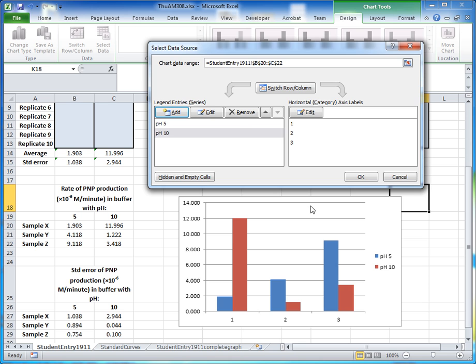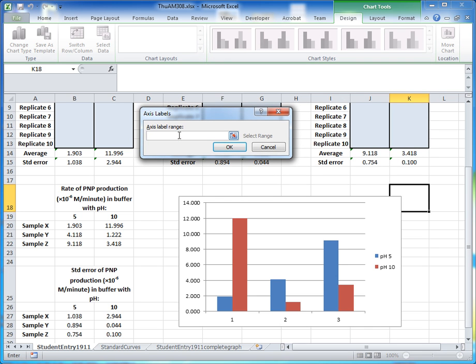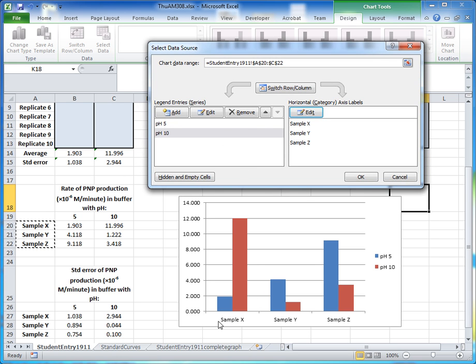You'll notice the x-axis is currently labeled 1, 2, 3. Instead, we want it to show Sample X, Sample Y, and Sample Z. To specify that, come over to the horizontal axis label Edit button, click Edit, and select from the spreadsheet the cells containing those names. Click OK, and Excel now graphs Sample X, Sample Y, and Sample Z on the x-axis.